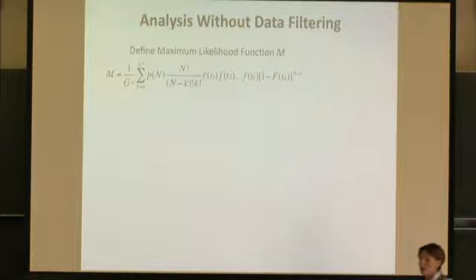So we can set up a kind of hierarchy of models and how to compare the data. One of the ways in which you can not filter the data according to the time window is what Eric mentioned to begin with, which is that you can take into account all the artifacts in the experiment using a maximum likelihood function. So I went to Eric and asked him, how can we not filter our data, include everything? And he said, well, you can just write down a probability to pick n proteins. This n is the number of domains that are in a given chain.